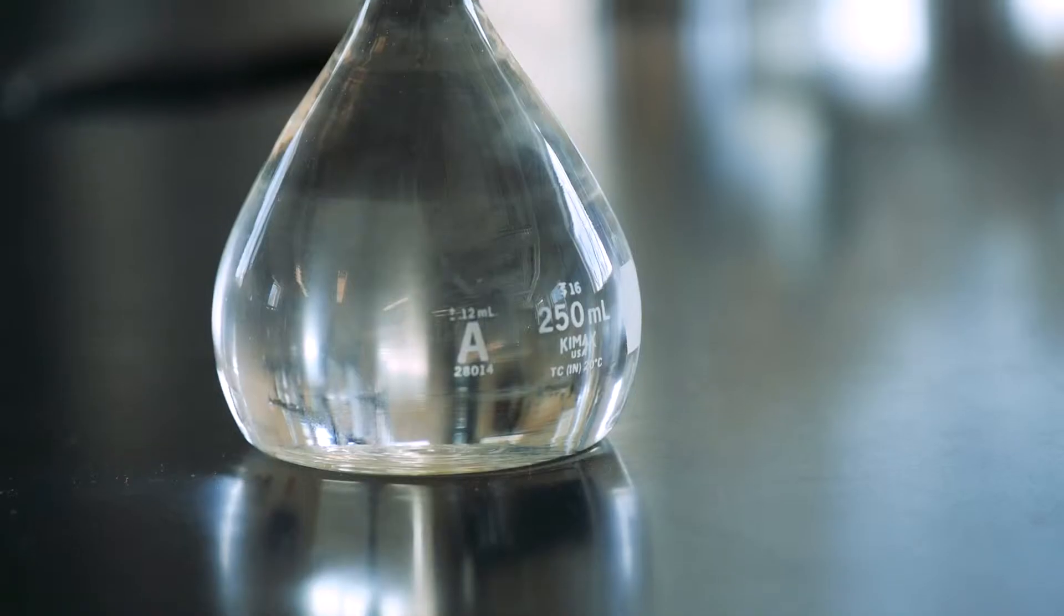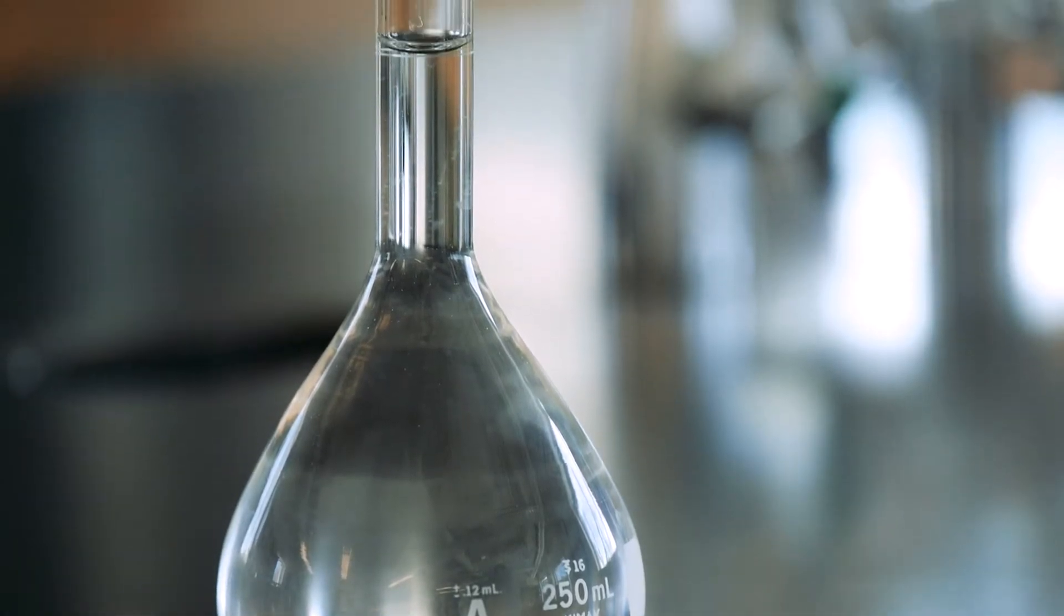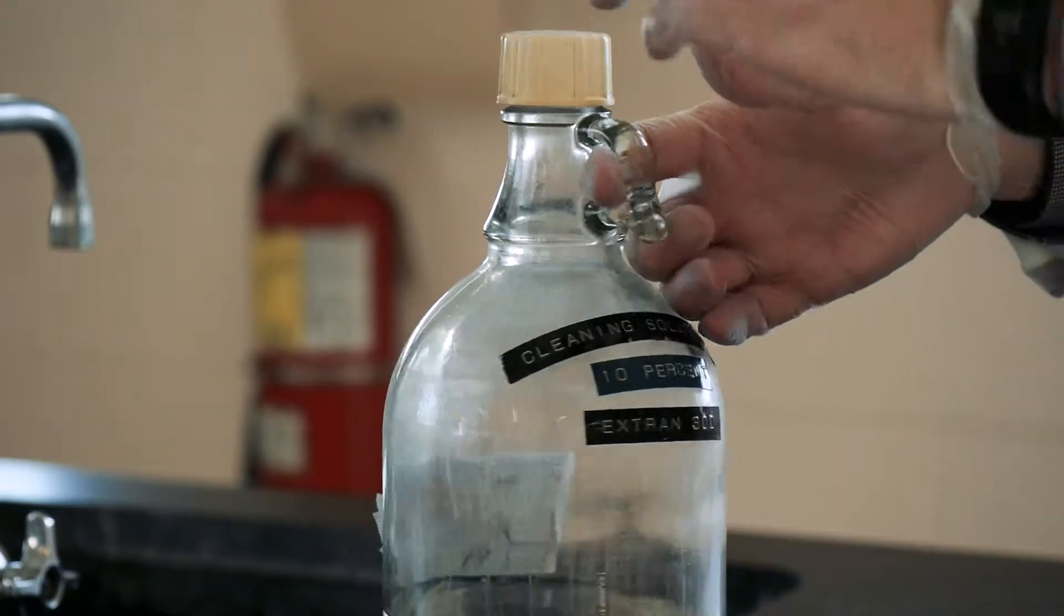A volumetric flask is a flat-bottomed bulb with an elongated neck calibrated to hold a precise volume of liquid. To clean and use volumetric flasks, first grab some Extran cleaning solution.